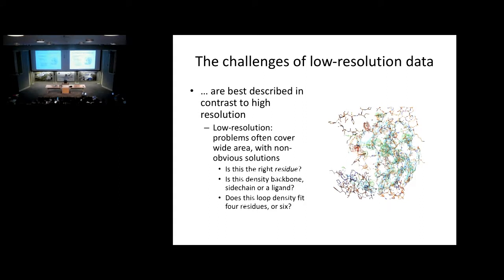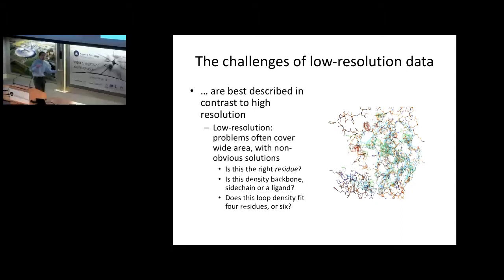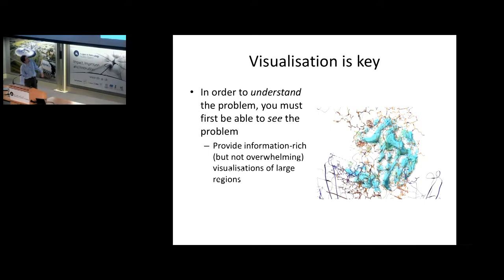But with your standard visualizations, that becomes very, very hard to see. And so one of the things that I've been really playing with, one of the first things I've been keen on doing, is simply working with new visualization modes, getting rid of this dichotomy of visualization versus model building and bringing them together so that you can actually see the problem that you actually need to fit.